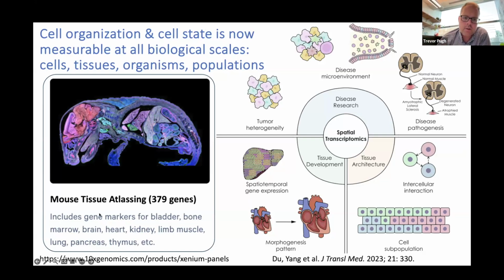And there's a bit of a cottage industry in this cell atlasing activity. I think Gary Bader's going to talk extensively about this, really trying to share all of this single cell data with or without spatial information, but then integrating your own data with the published data as important context. This has been very powerful in cancer because we can say, here's a set of cancer cells. How are these cancer cells different from normal tissues, and how are they dispersed throughout a cancer sample?